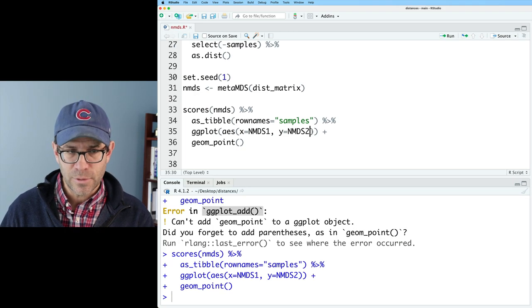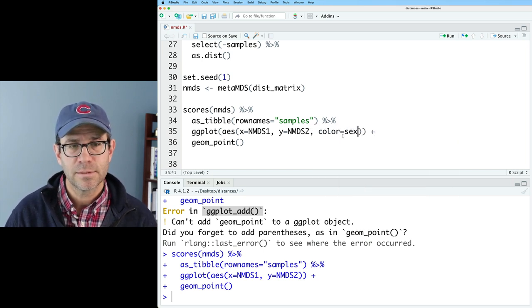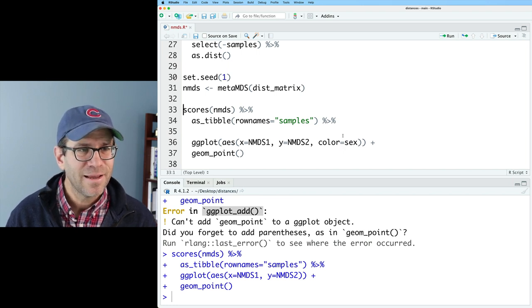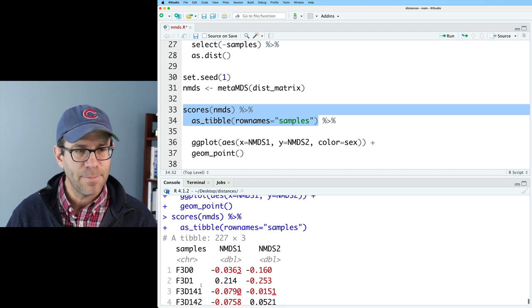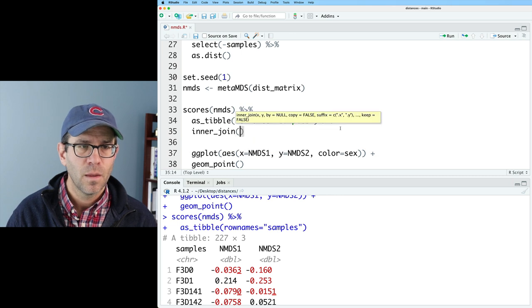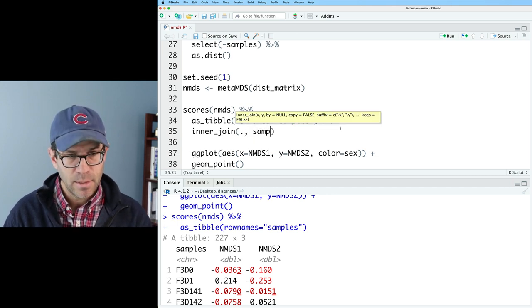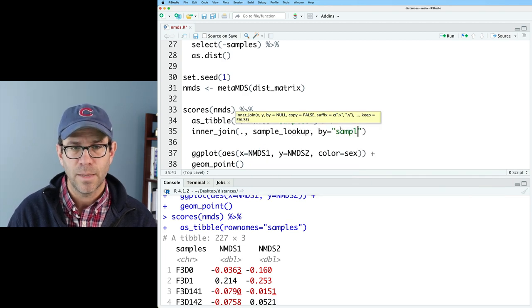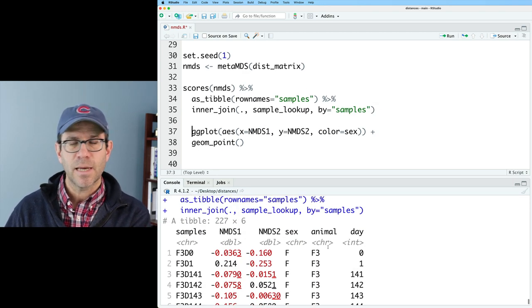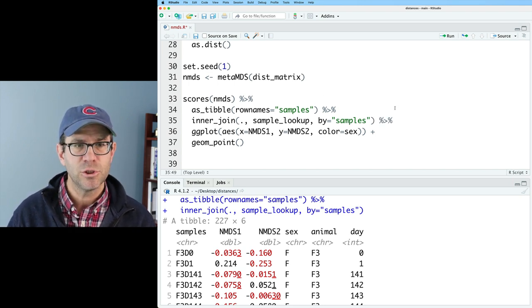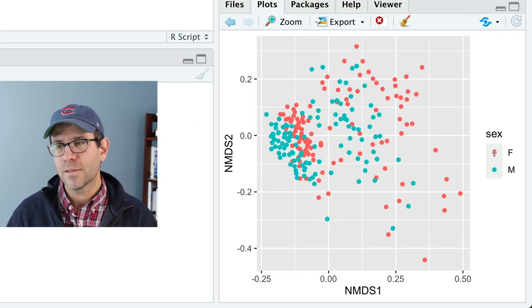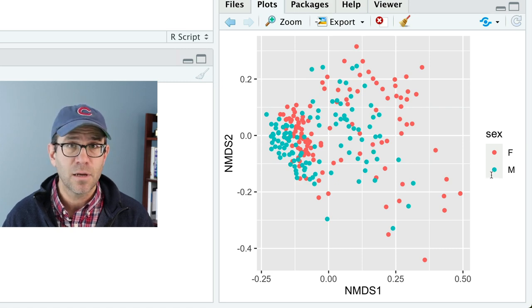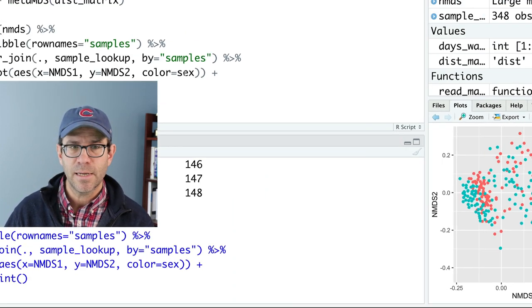I can do that by modifying my ggplot line here, where I could say color equals sex, but I don't have the sex information in here. So if I go ahead and look at things up to this point in the pipeline, I have the sample name. I don't have the metadata. So I can go ahead and do an inner join with the current data coming through the pipeline and sample lookup, and then I'll do by equals samples, and so then this will give me the sex, animal, and day columns for my sample lookup. I can then pipe that in a ggplot, and then I can color it by the sex. And so now I see that the salmon colored points are female, and the teal colored points are male. Not seeing any clear indication of a difference there.